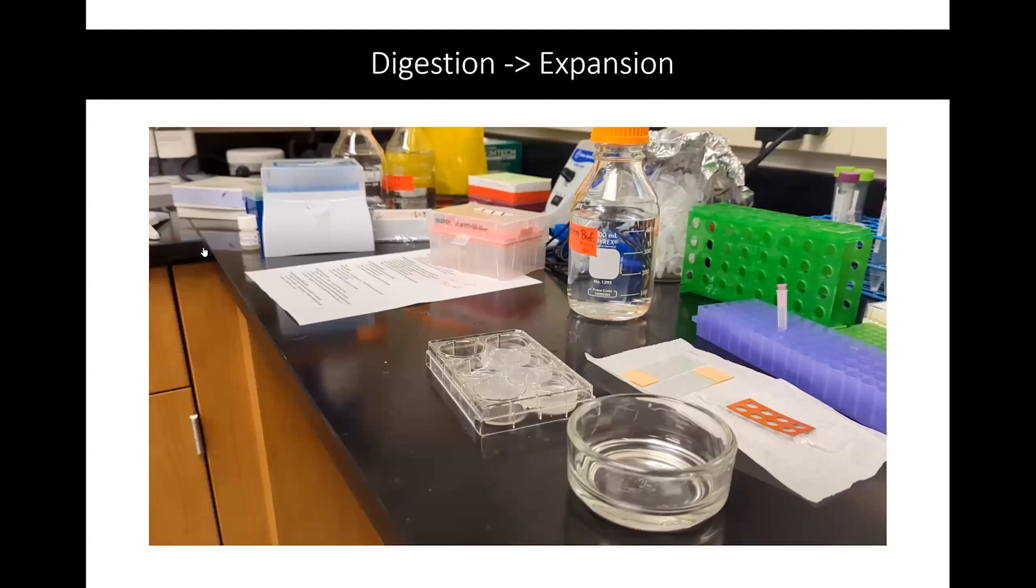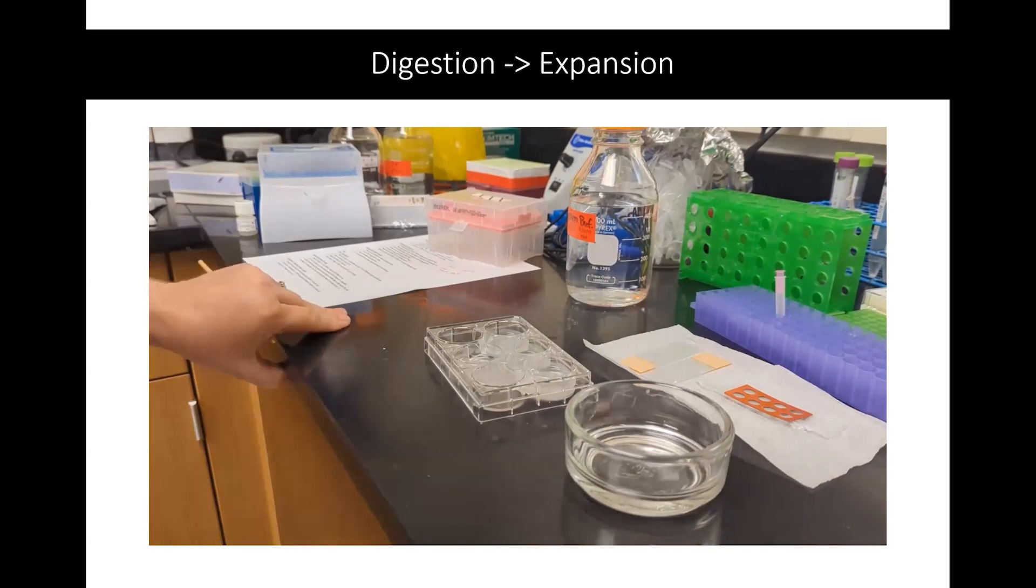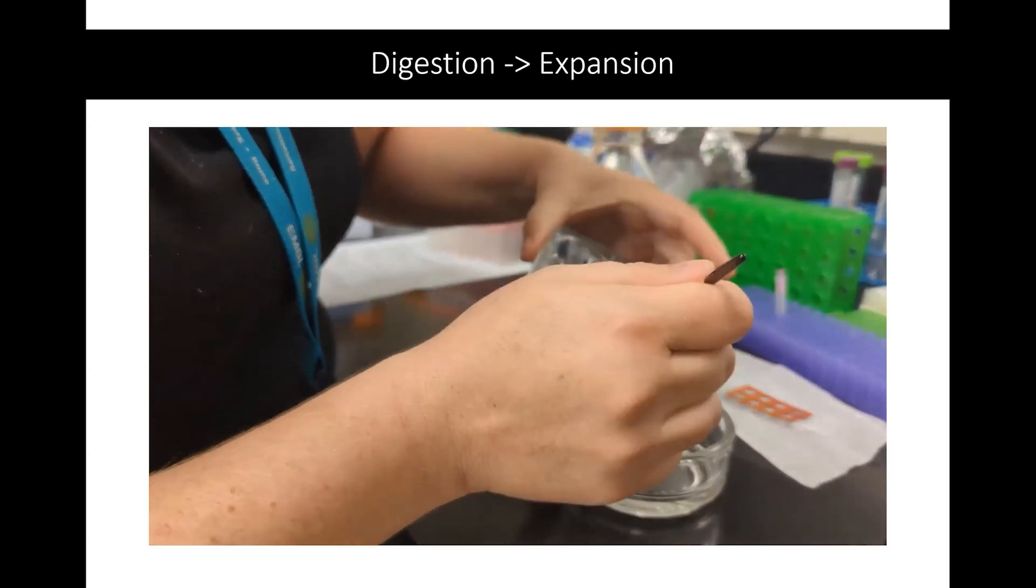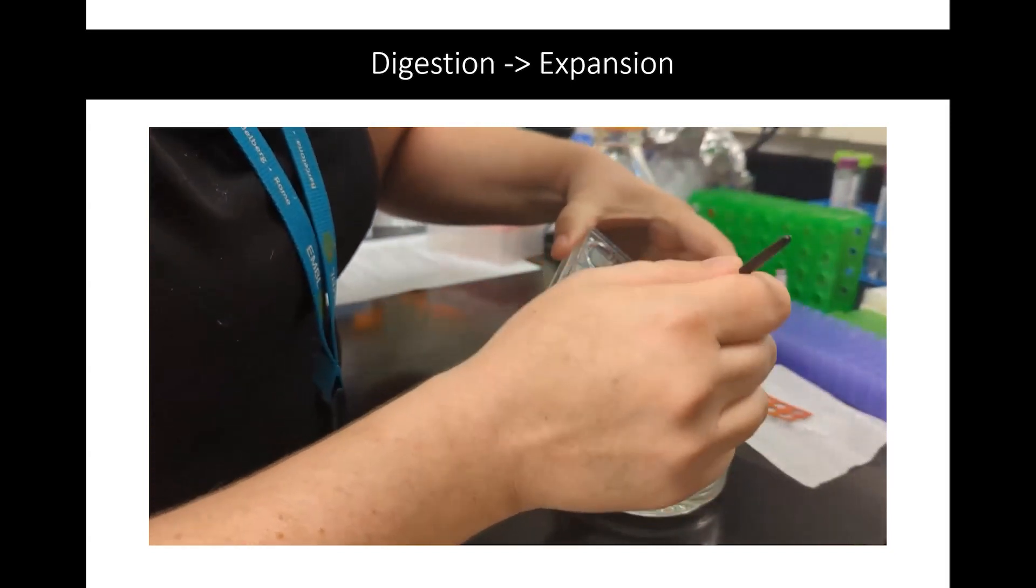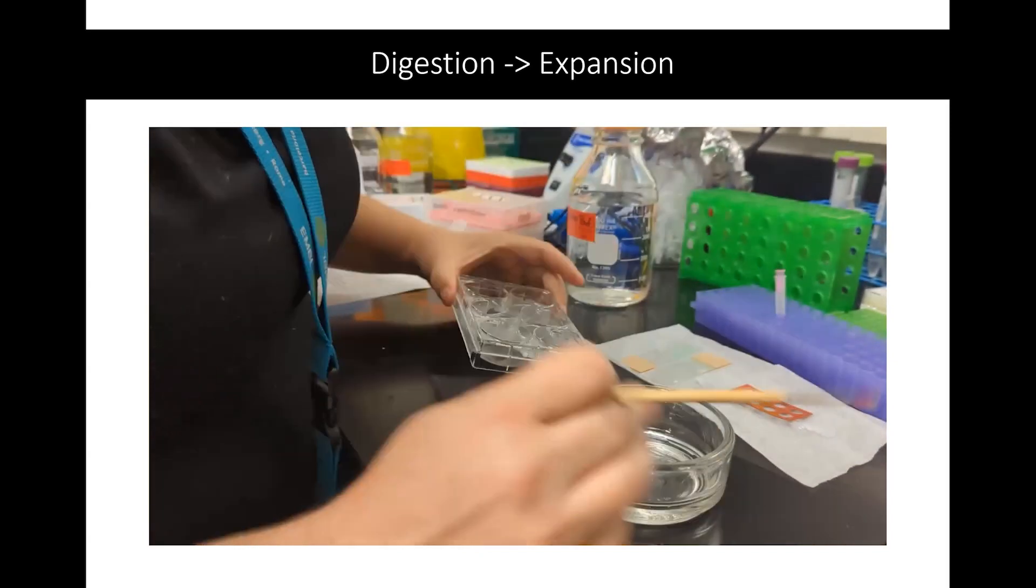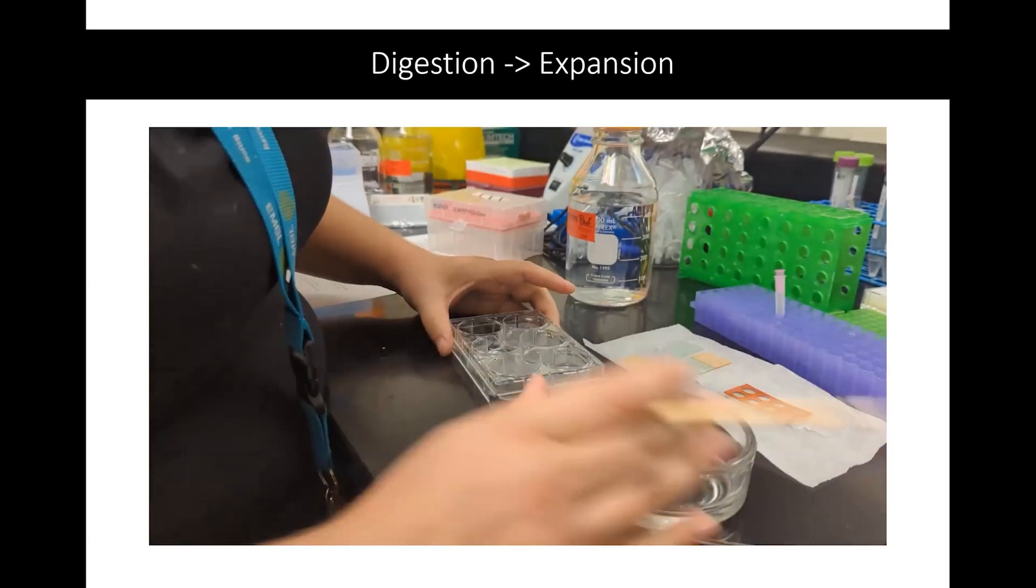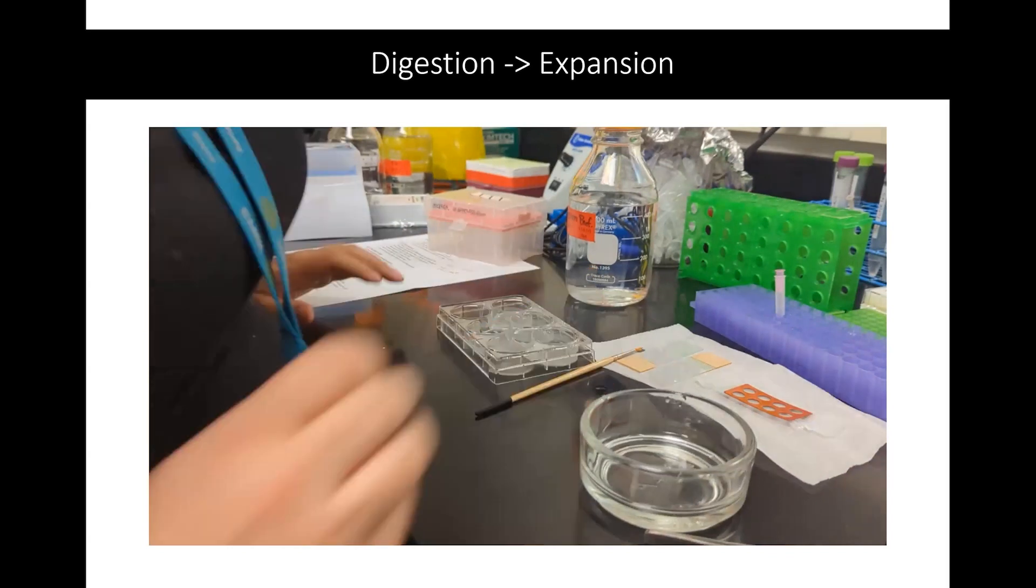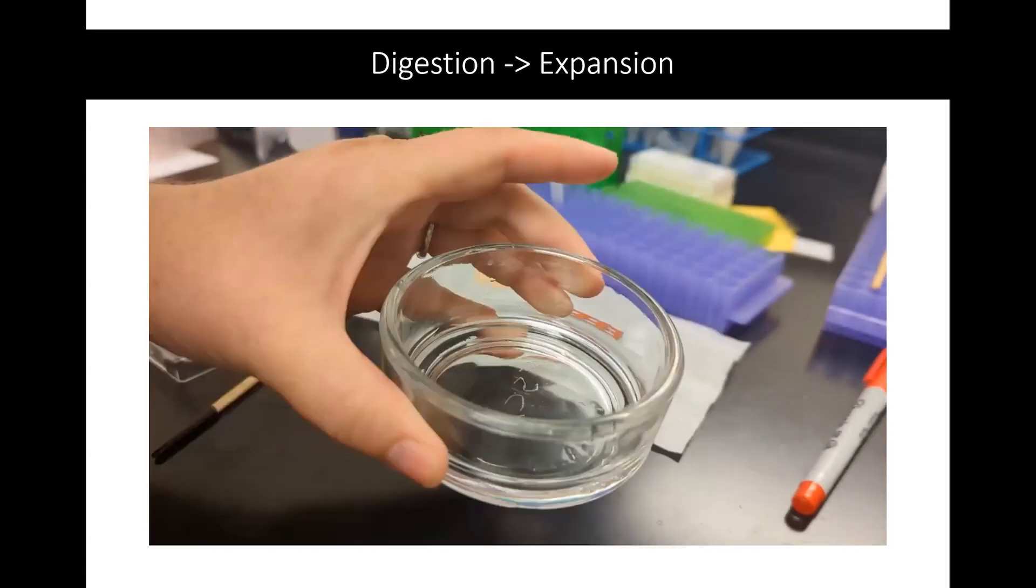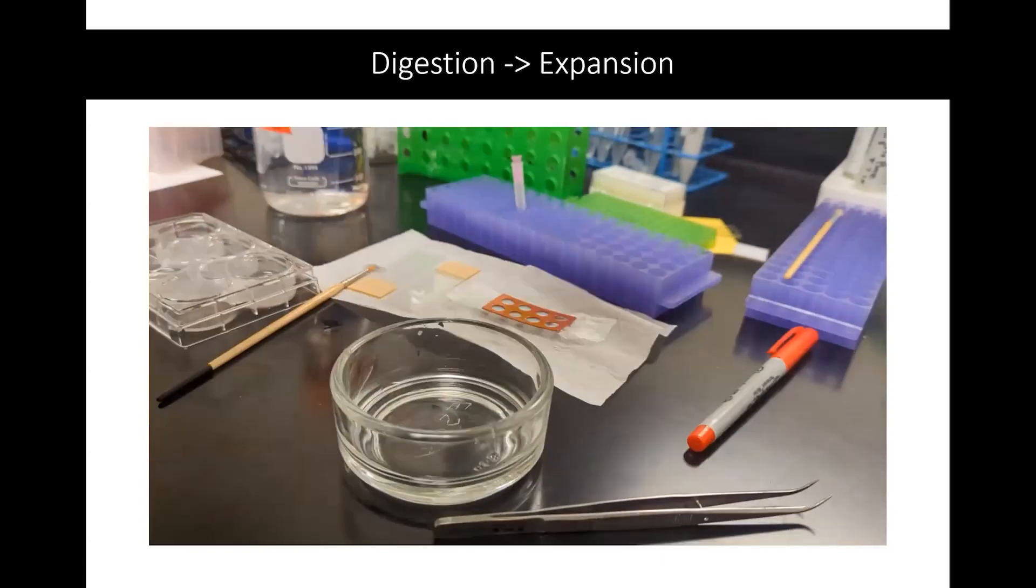And then not shown is adding the fresh proteinase K to do the actual digestion. So then moving from digestion to expansion, this has fully digested the sample. I'm taking a very gentle paintbrush that you would use for sectioning samples, and I'm just pushing it out of the well into a larger dish. And from there, I can now add distilled water to be able to do the expansion. And you can see that the gel has expanded somewhat during the digestion process, and this is entirely normal.